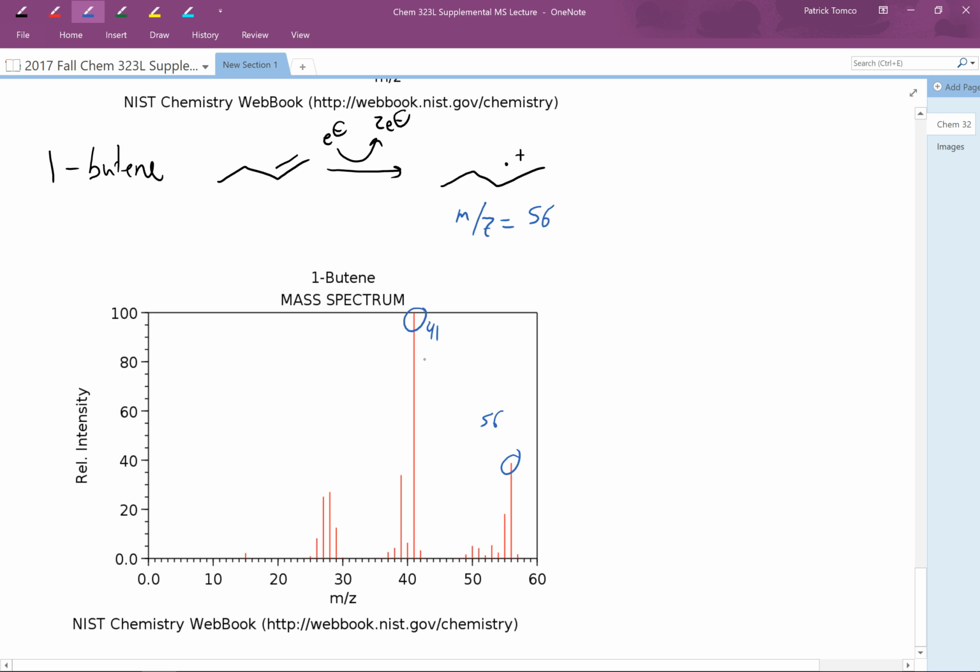Well, we want to make sure that we can show how the methyl radical is cleaving. The way that this radical cleavage occurs has to do with creating a new carbon-carbon double bond. I'm going to create a new pi bond at this position, and then I am going to fragment an adjacent carbon, or the alpha carbon. And I'm going to push from that single bond, I'm going to push the electrons into the peripheral carbon. And when the reaction occurs, what's left is a methyl radical, and I have now created an allylic cation. These are resonance stabilized, and so they are very, very stable. And this is, when I count them up, corresponding to the mass to charge of 41.